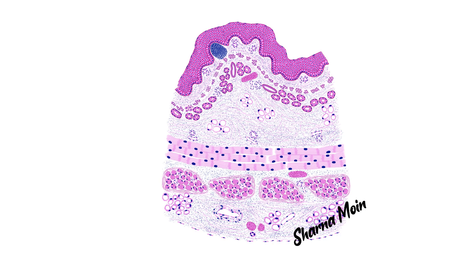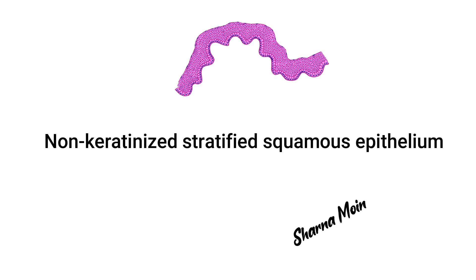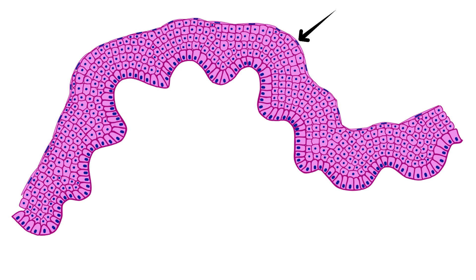First, the mucosa. This portion has three layers again: the lining epithelium, the lamina propria, and the muscularis mucosa. The lining epithelium of the oesophagus is a non-keratinized stratified squamous epithelium. If we zoom into this picture, you will be able to see this is multi-layered — or stratified. You can also see the top layer here; the nuclei of this layer are flat.